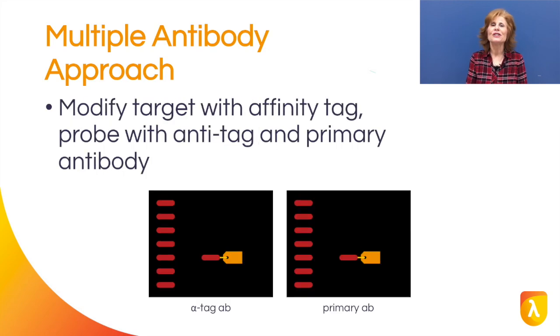A different way to use the multi-antibody approach is to modify the target protein with an affinity tag such as His6, MYC, HA, or FLAG, or fluorescent proteins such as GFP, RFP, mCherry, etc. Then use the modified protein as the target for a well-characterized anti-tag antibody and the target-specific antibodies under evaluation. Corresponding bands of the correct size on both blots are indicative of antibody specificity.